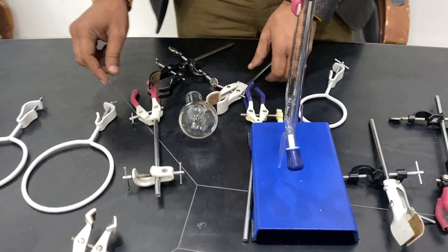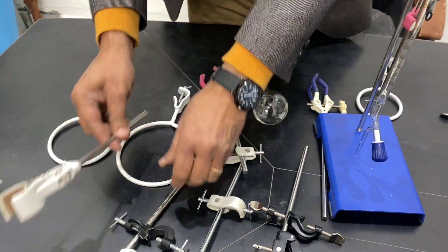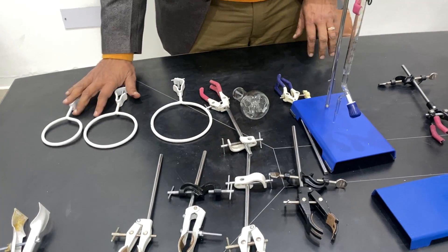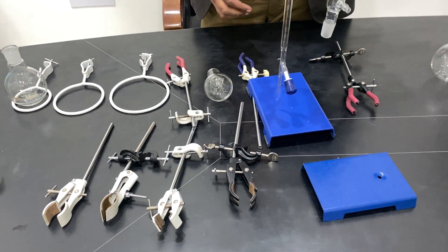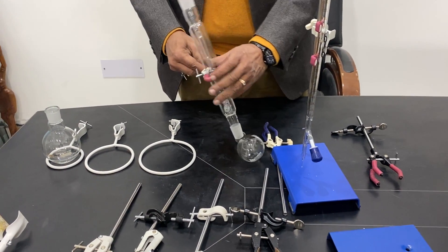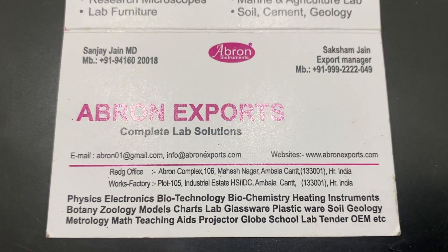To summarize: clamps with a strip are the three-finger clamp; this is the four-finger clamp with two fingers on each side. Without fingers, this is called the universal clamp — also called the universal metal strip type and the universal die cast type. Then there are funnel stands, separating funnel stands, or flask stands depending on which type of flask is being used. The three-finger clamp is also used for holding the condenser and is sometimes called the condenser clamp. There is another smaller base as well. Please visit our website and write to us at abron01@gmail.com. Thank you.